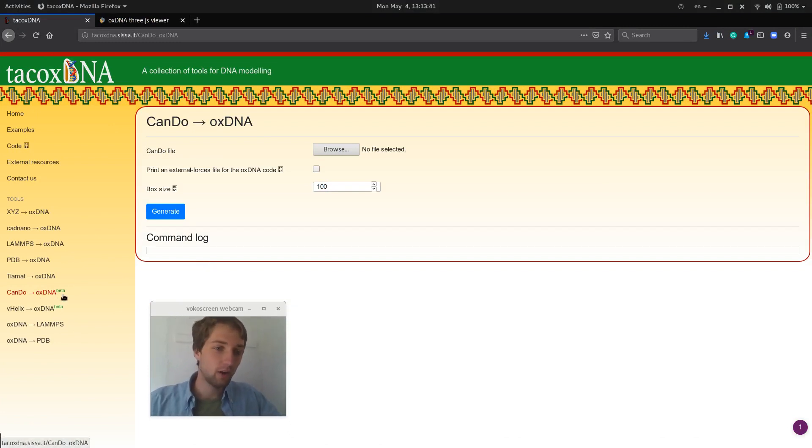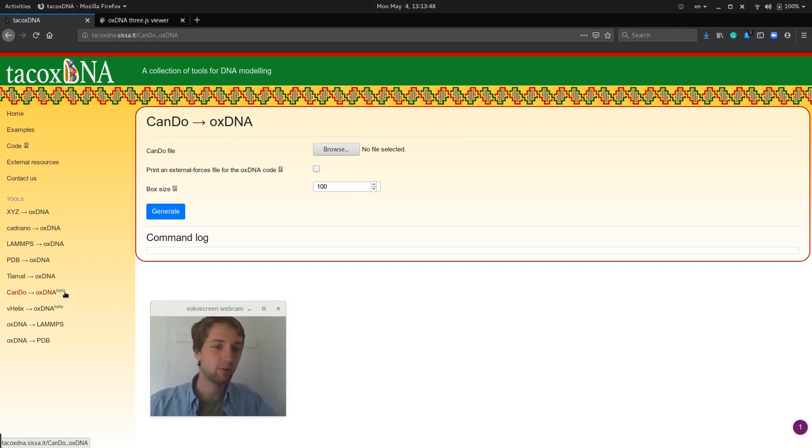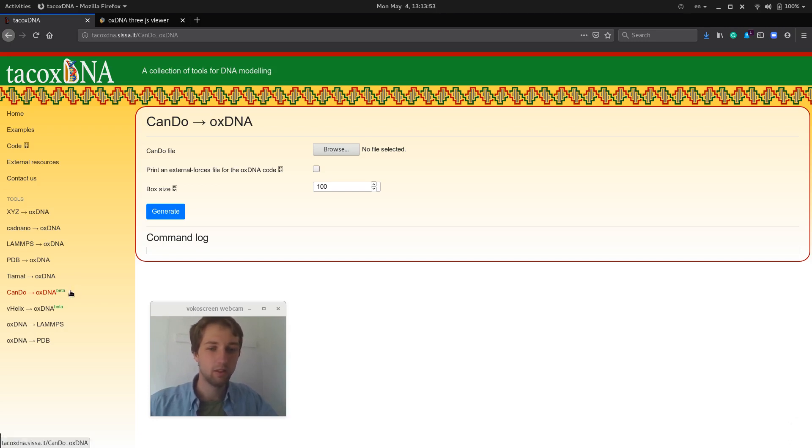But so far the script that does the conversion doesn't really handle single strands properly and therefore it's still in beta and not really usable in all applications.